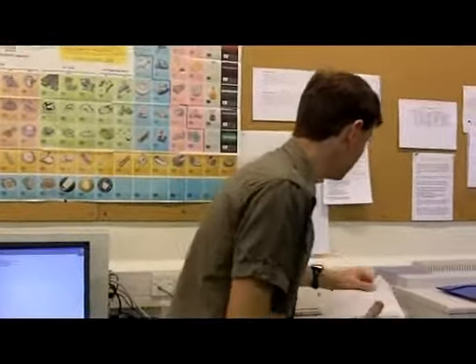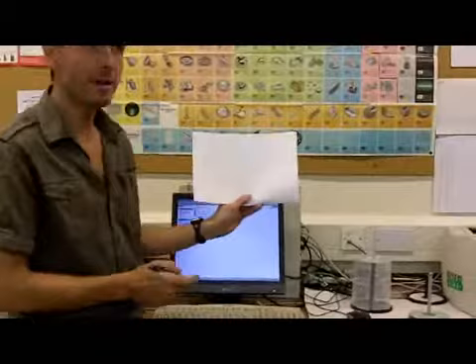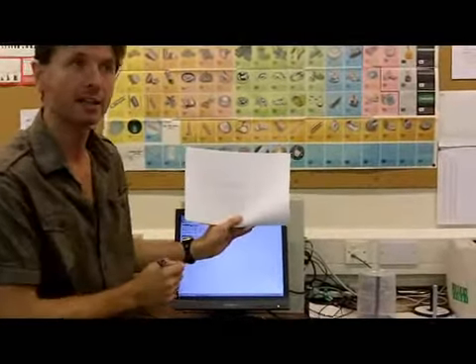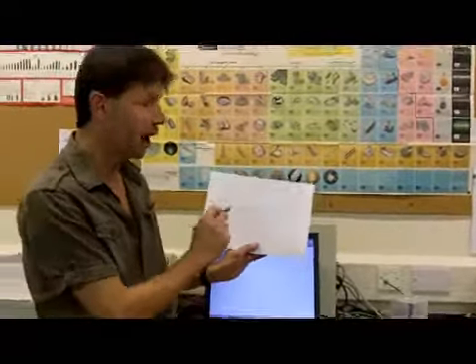You'll be measuring the height of the carbon and of the iodine. There's things to say about both of them. The carbon spectrum is quite noisy. You'll see that the signal looks like this, and you'll be tempted to measure the height of peaks which aren't really there. So be a little bit careful about that. Convince yourself there is truly a peak to measure the height of. Don't just measure the height of noise. So that's the carbon region.